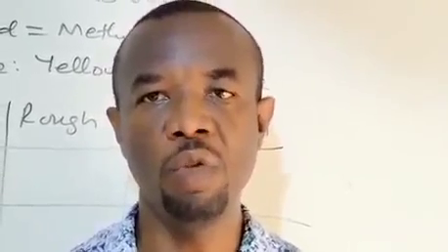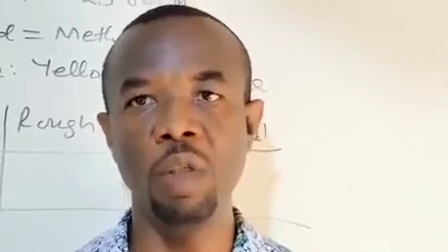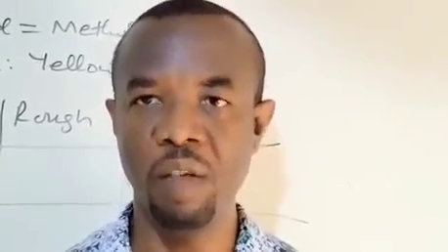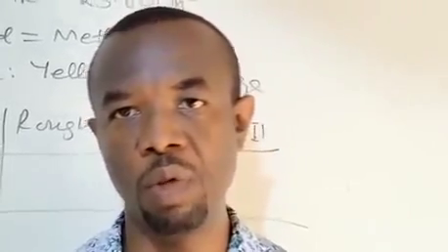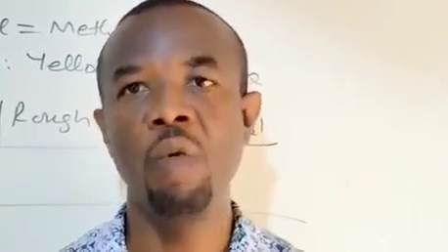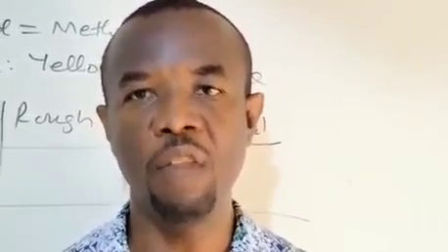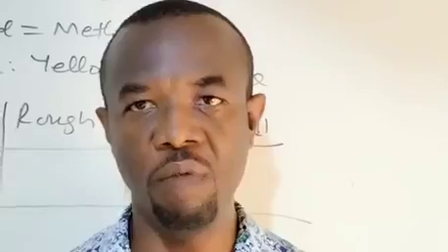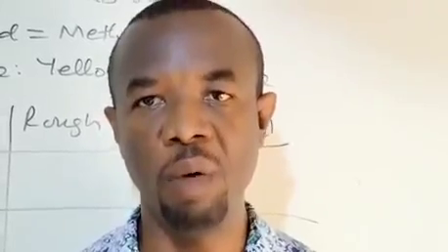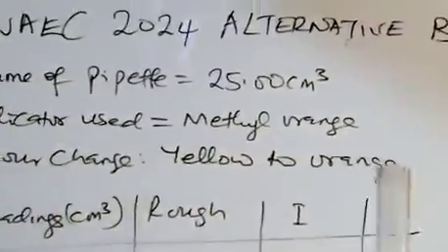Then you're also given 5 cm³ of acid in 1 dm³ solution for D, which is HNO3. While our E, the base, is sodium carbonate, we have 3.5 grams of the carbonate dissolved in also 1 dm³ of solution. So we have the format for reporting our titration on the board.